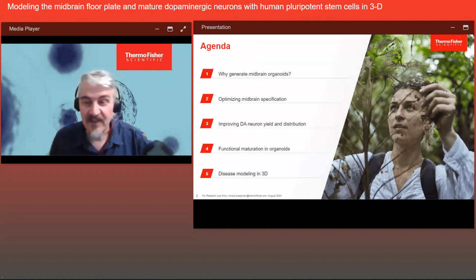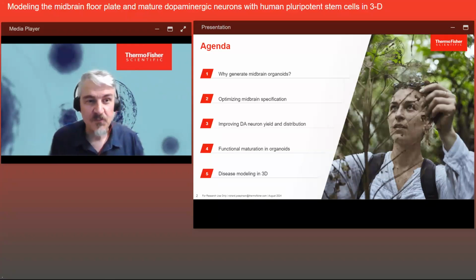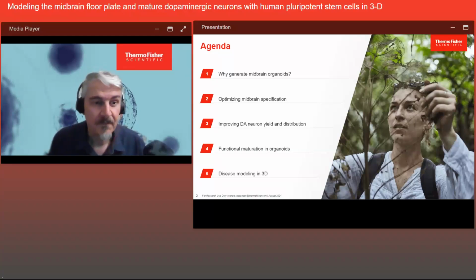To give you an outline of the topics in this seminar, first I'm going to talk about the reasons why organoids are valuable for studying human disease and introduce some of the issues that are very common in the field. Then second, we'll talk about how we use 3D culture to improve the brain region-specific differentiation of induced pluripotent stem cells.